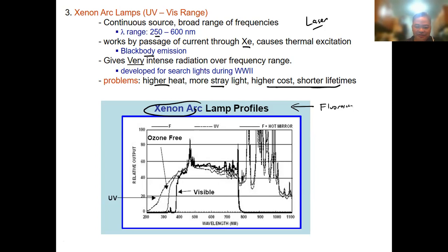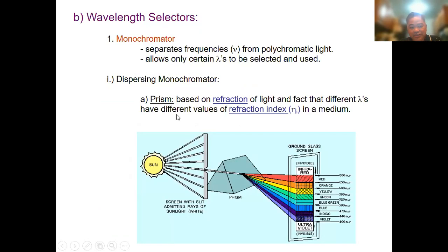So if you look at the profiles that you have here, this is all it covers, around 250. So you can have the UV-Vis until the one here. Okay. So that's the light source, at least in UV-Vis. We don't cover lasers. You don't usually have lasers in UV-Vis because a laser is monochromatic, so you can only scan one wavelength. And if it's a laser, I don't think you're going to need this. Right?